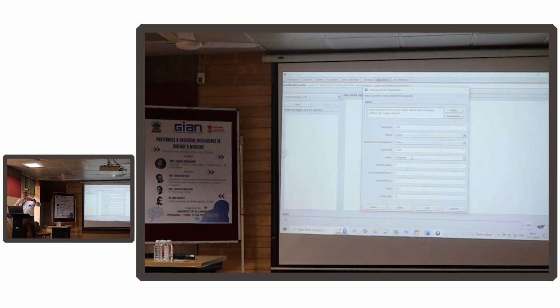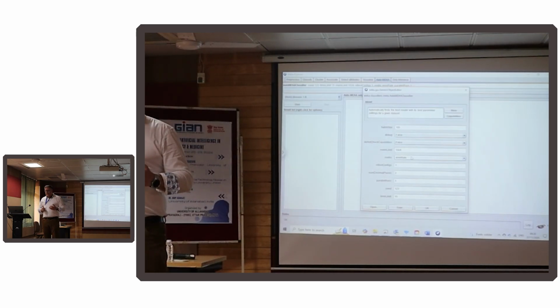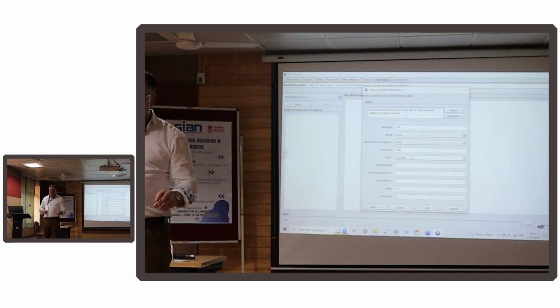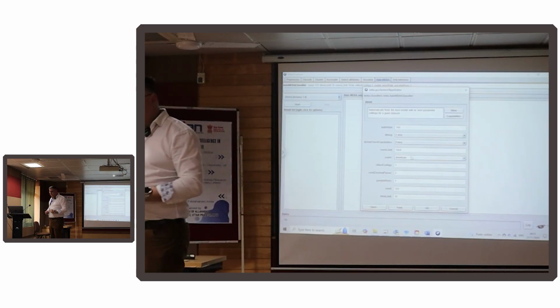Because it's a randomized process, the way the cases are selected, the way the weights are initialized, there's a lot of randomness in there about setting up. But that can be an advantage. If we find things that are there despite that randomness, then they're more powerful. Because ultimately it's starting off with a random state and then finding the correct state. And if we keep finding that same correct state, then it's going to be reinforced.